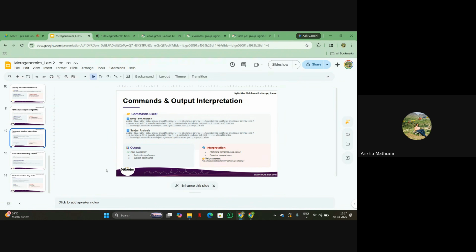in the metadata, because the metadata is just getting correlated to name the feature ID and to understand the distances between them. And then the Newick format gives us some code that we upload on the iTOL website, where you can just observe the phylogenetic tree that is getting generated.